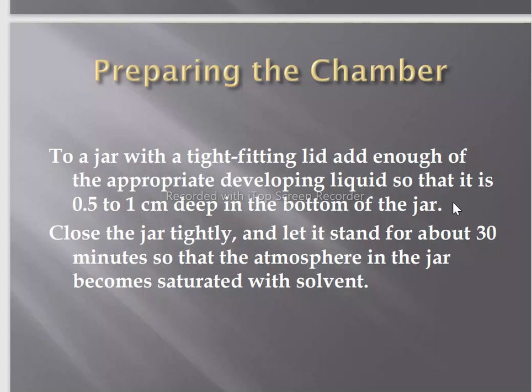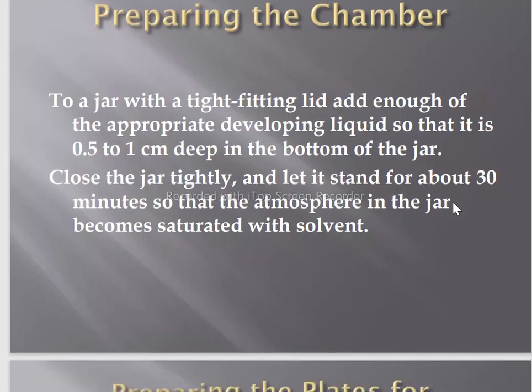To a jar with a tight fitting lid, add enough of the appropriate developing liquid so that it is 0.5 to 1 centimeter deep in the bottom of the jar. Close the jar tightly and let it stand for 30 minutes so that the atmosphere in the jar becomes saturated with solvent.